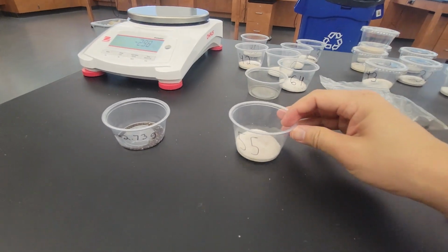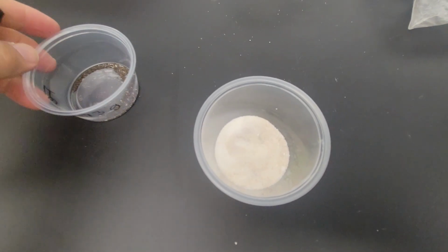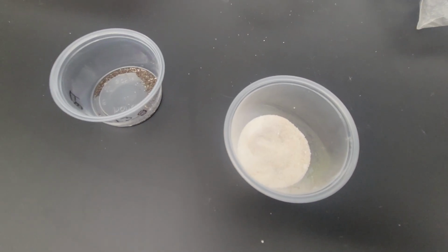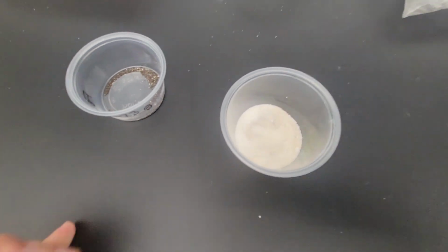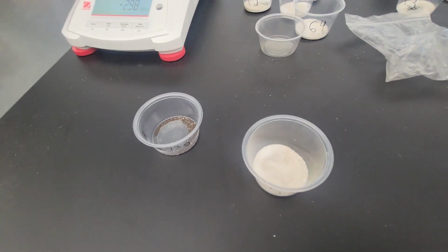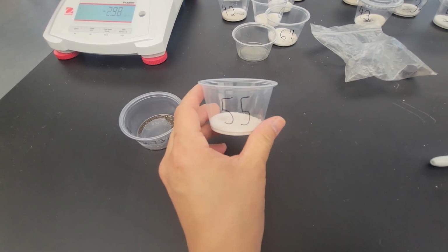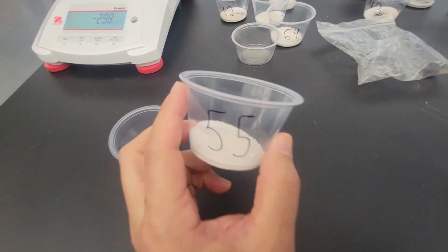Now back to the mixture, we're left with sand and salt. So how do we get sand and salt separated? What physical properties do they have different from each other? So hopefully you said salt dissolves in water, it's soluble, and sand does not. So that's what we're going to do next.